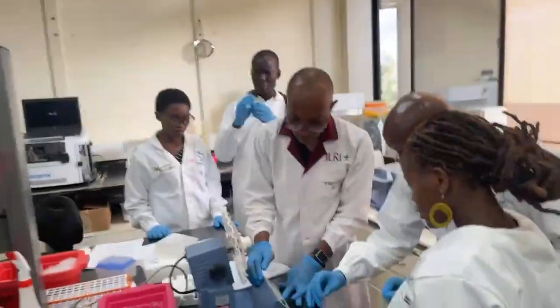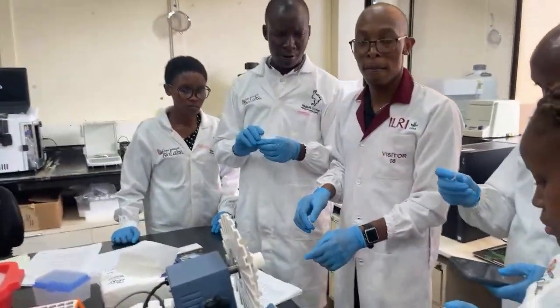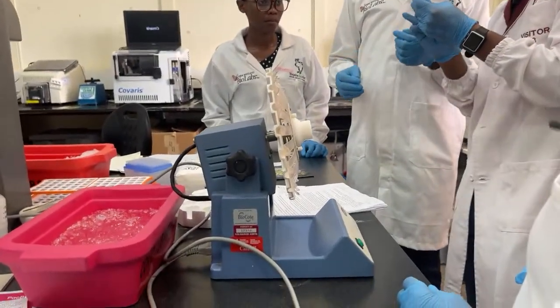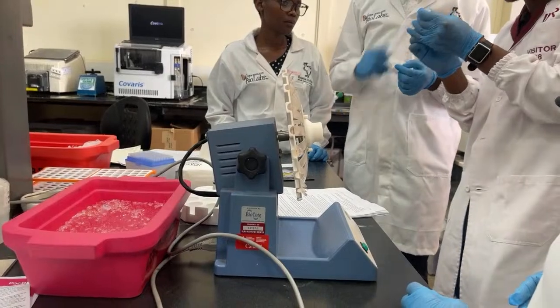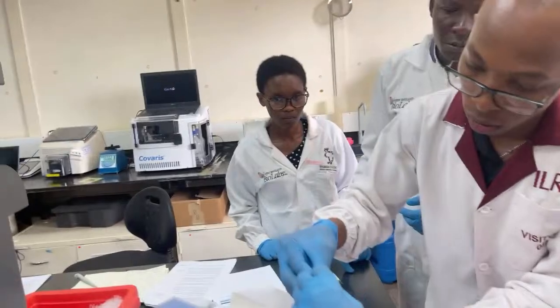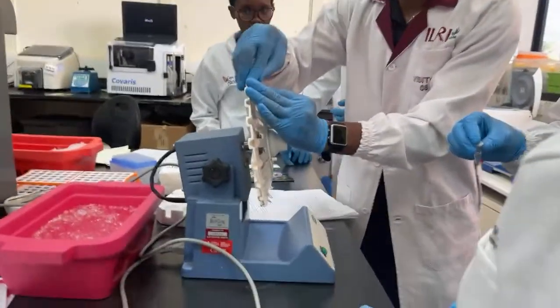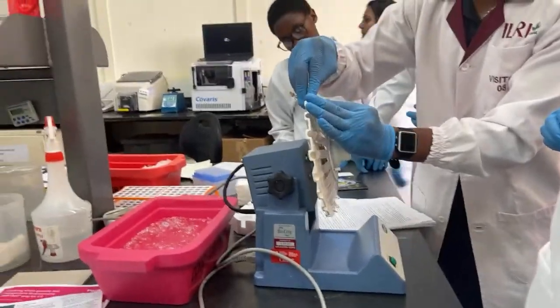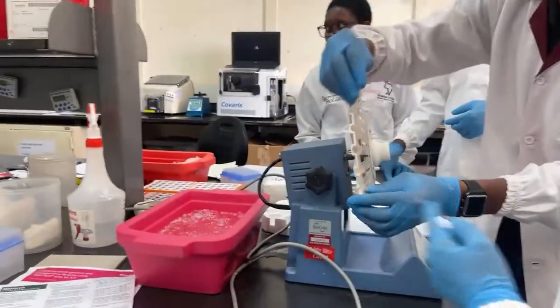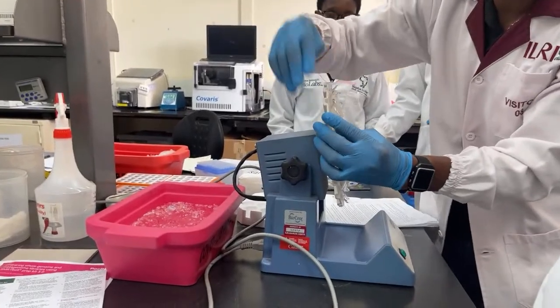Wait. Okay. We just make sure it's tight. That's one. It's a rotator. What does it do? Just mixing. No, this one you don't need to balance. Where's the other tubes? Where's your tube? Yeah, all of them. All four come on this one.